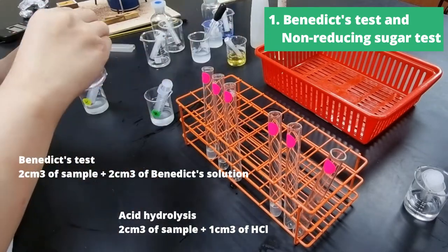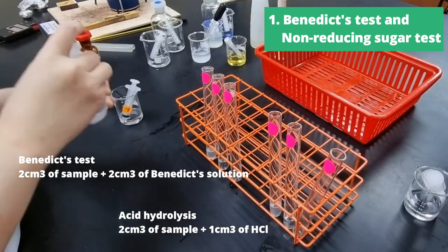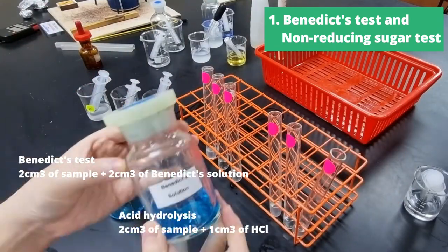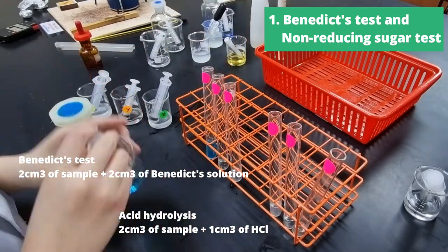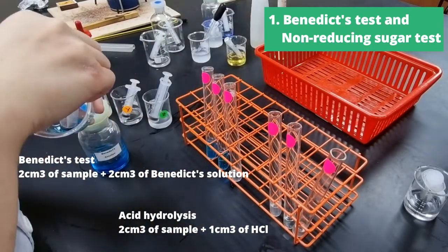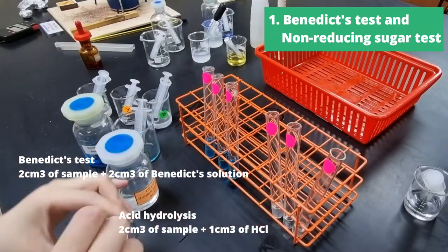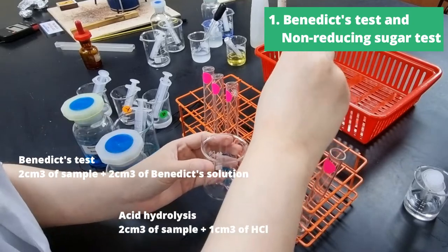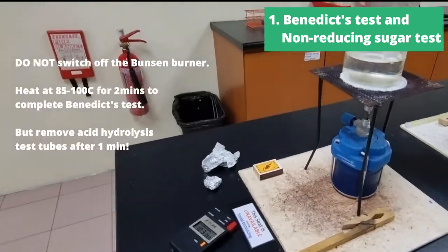So in the first three test tubes, labeled X, Y, and Z, I place 2cm³ of the sample and 2cm³ of Benedict's solution for Benedict's test. And in the next three test tubes, we have the acid hydrolysis going on, so I added 2cm³ of sample and then 1cm³ of hydrochloric acid to each test tube. This is multitasking to make sure you can complete the experiment in time.